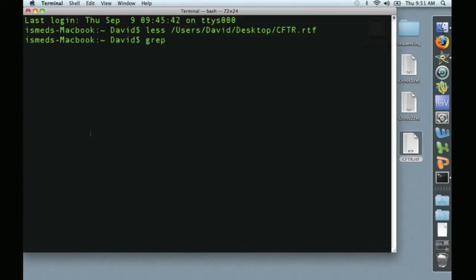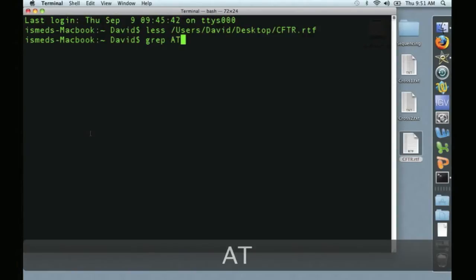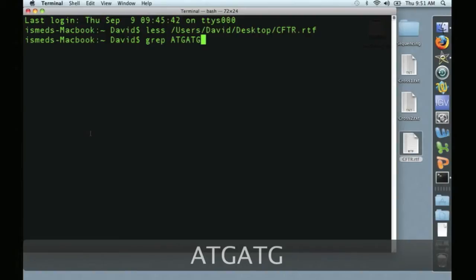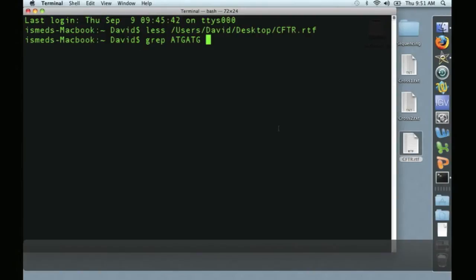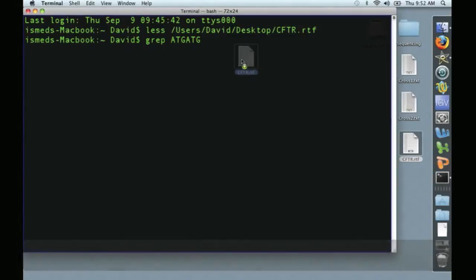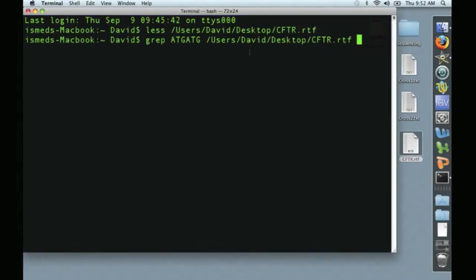First, we're going to use GREP to search within a sequence. So say I wanted to look for the repeat ATG ATG. I simply type GREP ATG ATG, and then the file name, which again I'll drag and drop.